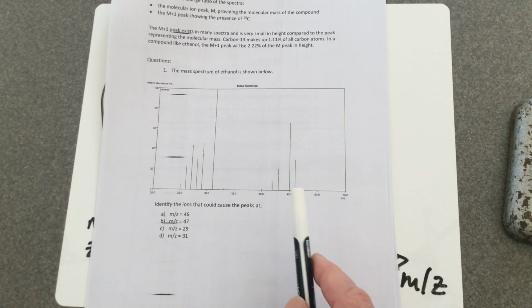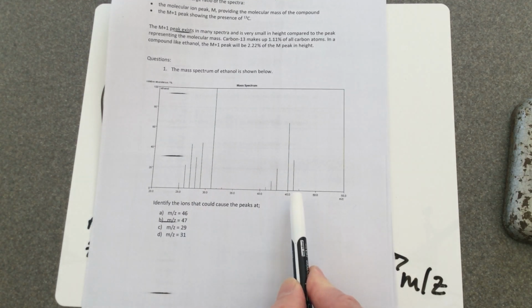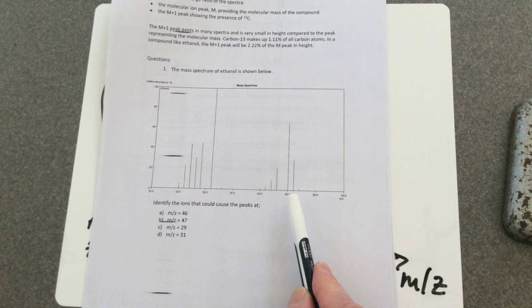So I can use this to identify the MR from the molecular ion peak. That's at MZ 46. At 47, that's caused by isotopic variation, the presence of a carbon-13 atom in the molecule.